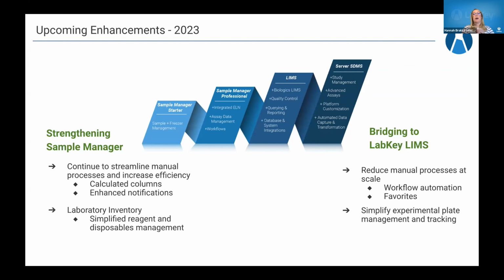So making sure that that bridge from Sample Manager to our LabKey LIMS is really clear and tight, and that it's easy for folks when they're ready at scale to start going up this. So reducing some of those manual processes, including having more automated workflow processes and the ability to add favorites at scale. And then also simplifying experimental plate management and tracking of those plates within the lab.